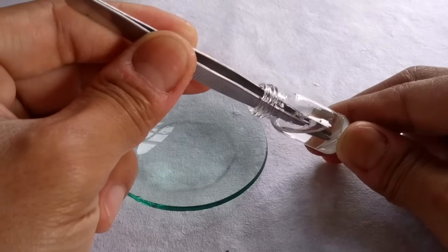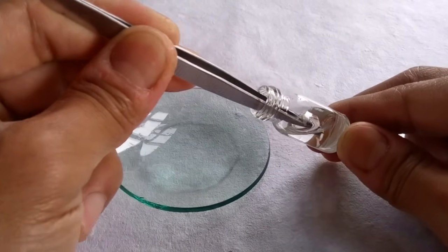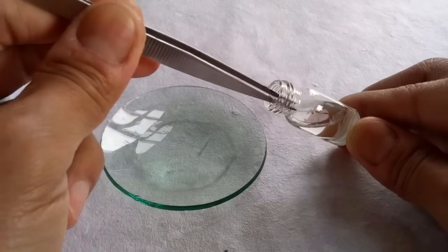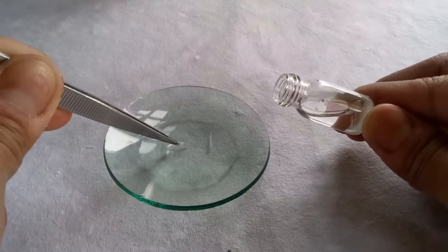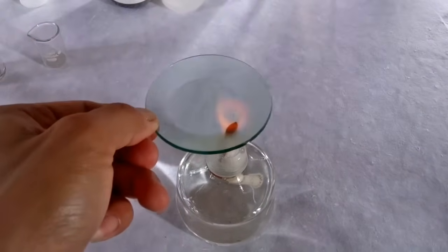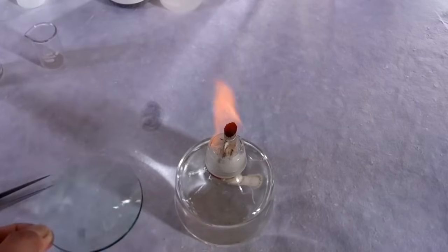Either way, take a few root tips from Carnoy's fluid or ethanol and transfer them onto a watch glass containing 1 normal hydrochloric acid. Acid will soften the cell walls and weaken cellular connections so it becomes easy to squash the root material later. Gently warm the watch glass on a flame for about 5 seconds. Expose the root tips in the acid for about 2 minutes.